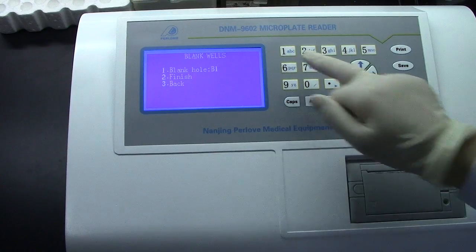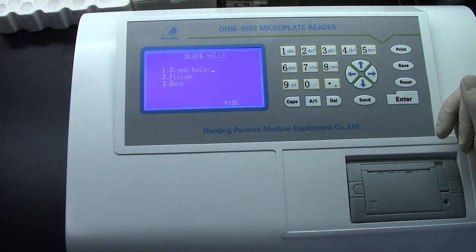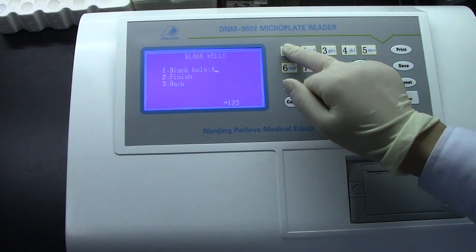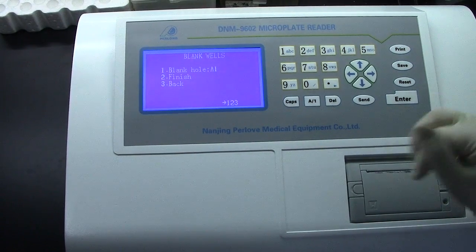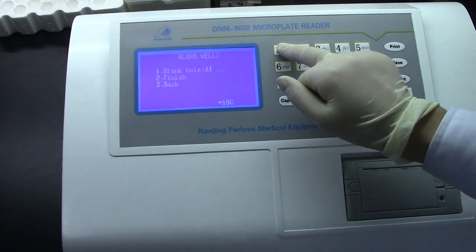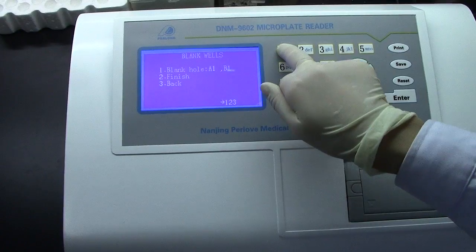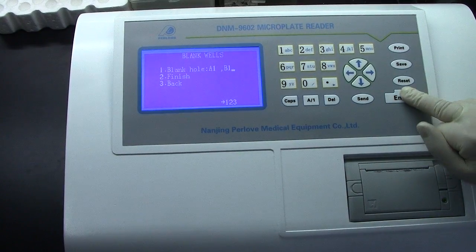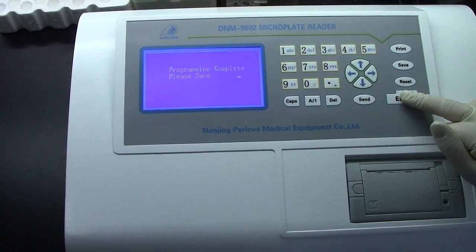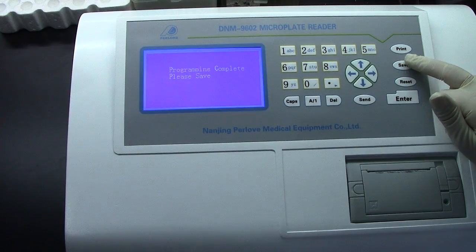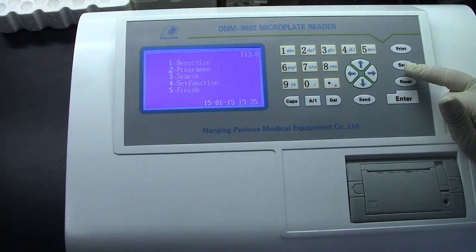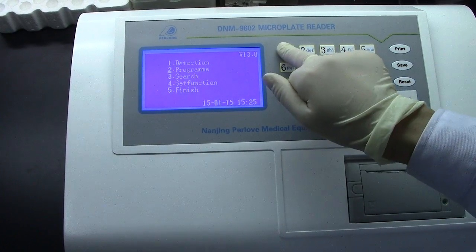Blank Well. We want to set only one blank well: A1. If you need to set more, press End — you can set B1. Now just press Save to save the program. If you want to check program 1, press 1 Detection. You can see it has CRP now.